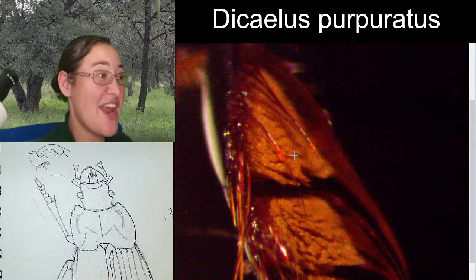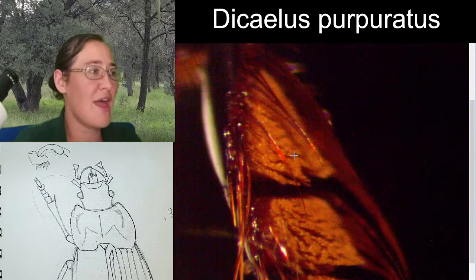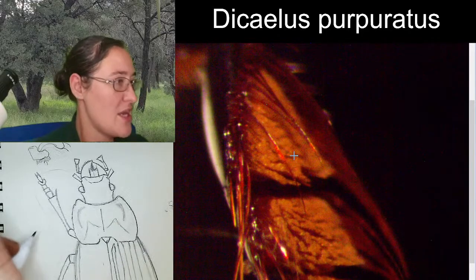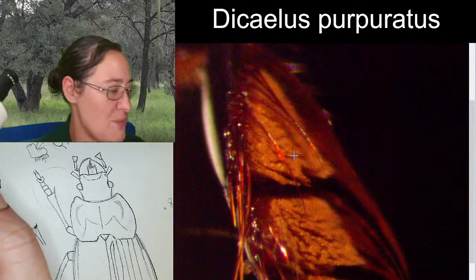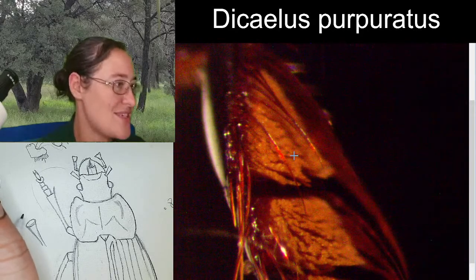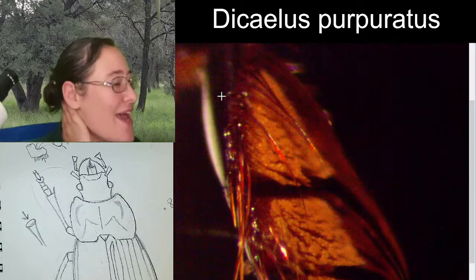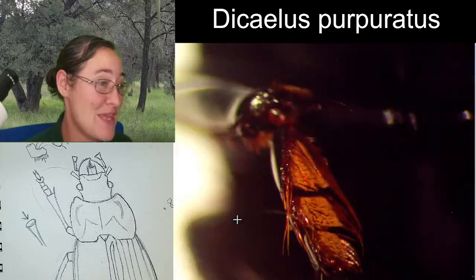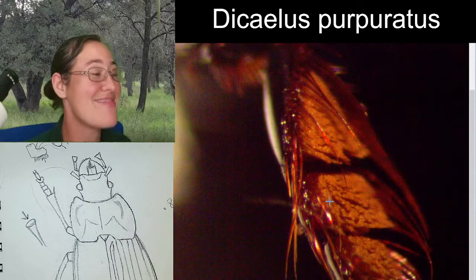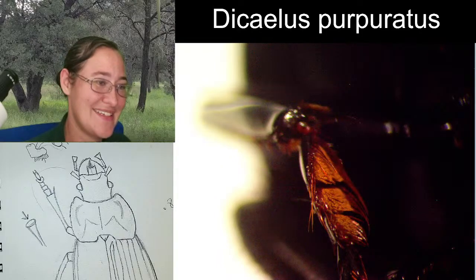Setae, their hairs. But in diving beetles, the males will have setae, or hairs, that are like little suction cups. They're shaped like this, where they're kind of narrow at the base, and they're wide and conical. They're hairs that are shaped like this, and then they suction cup. And they actually suction cup to the female's back during the mating process. And that's what this reminds me of. I can't tell you for sure that's what they're used for, but that would be my guess. That's really nifty.